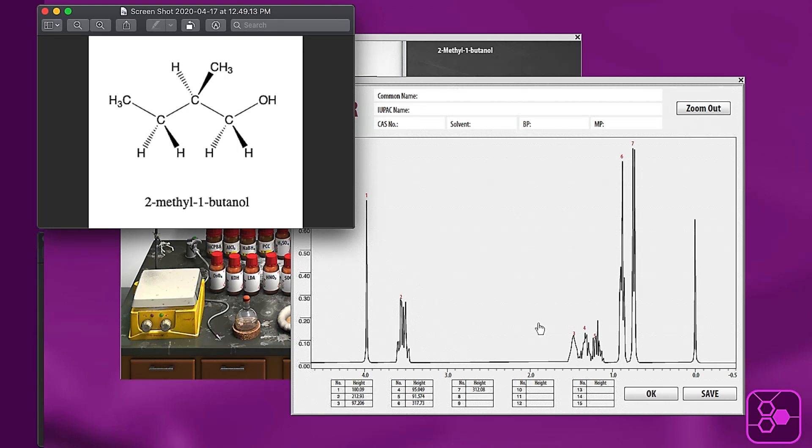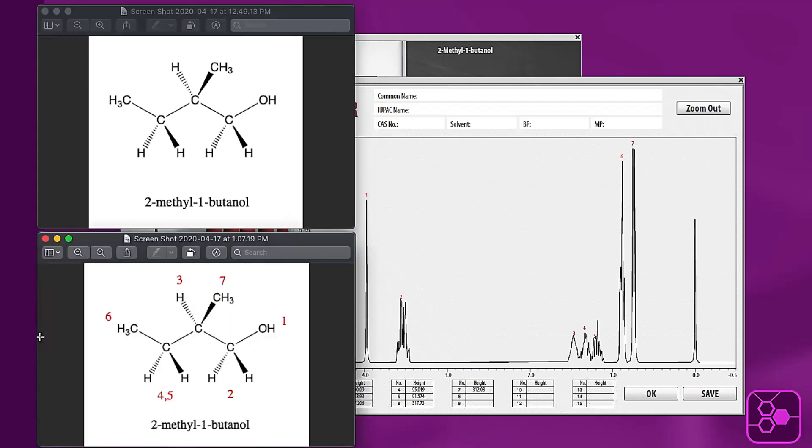Now based on other things you will have learned about splitting as I mentioned, and the shielding and deshielding that occurs, you could go through here and make the assignments of these other peaks. And you should get something that looks like this. So I've just gone ahead and made an assignment with these peaks based on this proton NMR using the zoom ability and using the heights provided in the spectrum to compare to each other.